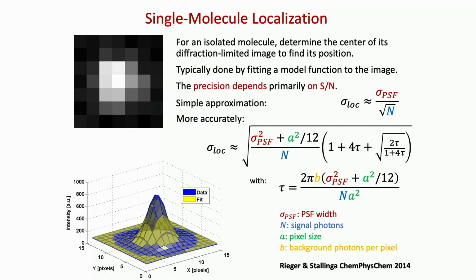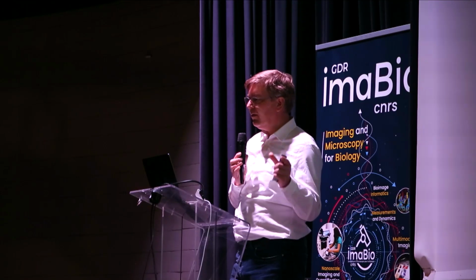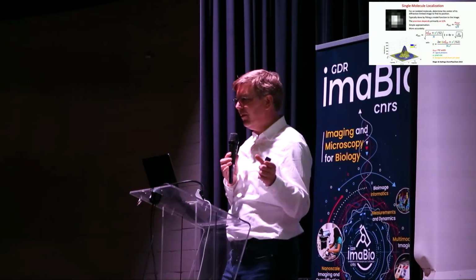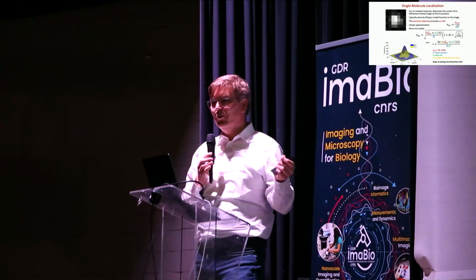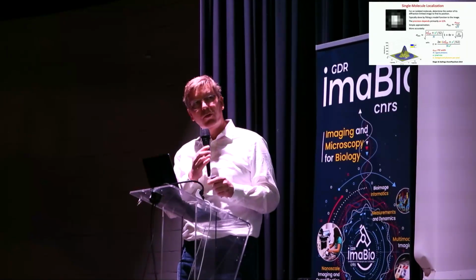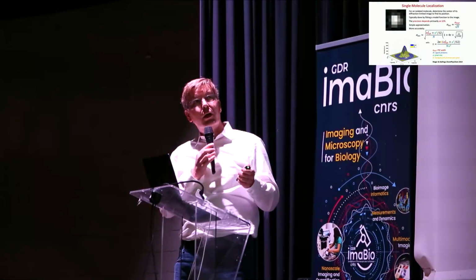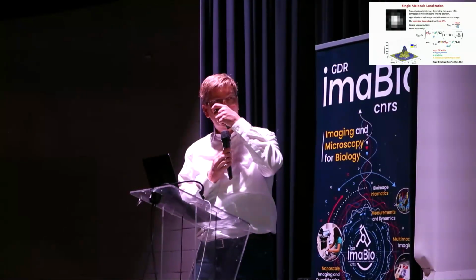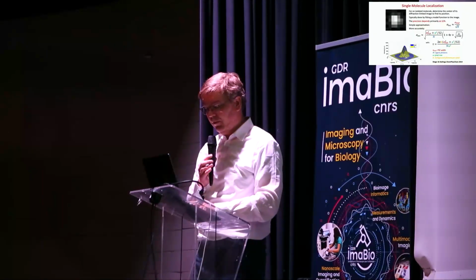The pixel size, and that's very important to keep in mind, has a small effect on the localization precision. We normally consider this negligible, and the pixel size is not limiting your resolution. You can have a 100 nanometer pixel size and still get 10 nanometer resolution. Okay, so that's just from a conceptual perspective here for the students in the audience. So these are the terms that you need to keep roughly in mind when you do localization microscopy.